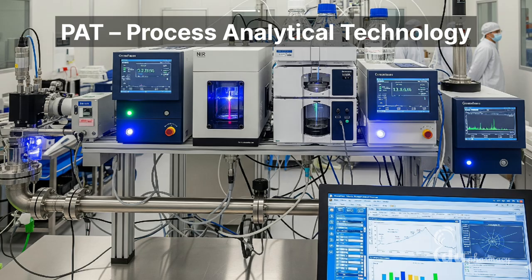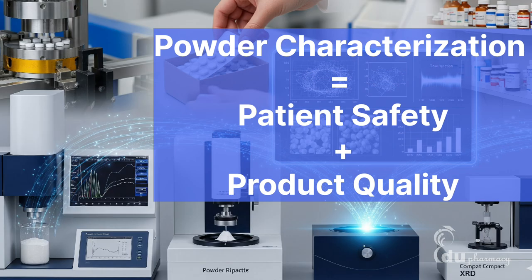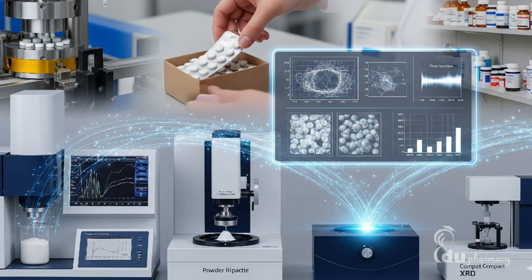To wrap it up, powder characterization is the backbone of pharmaceutical product development. Every property, size, shape, surface area, porosity, flow, and moisture plays a role in determining how a medicine performs. By carefully studying these parameters, scientists can design formulations that deliver consistent results, meet regulatory standards, and most importantly, keep patients safe. Thank you for joining me in this deep dive into powder characterization in the real world.